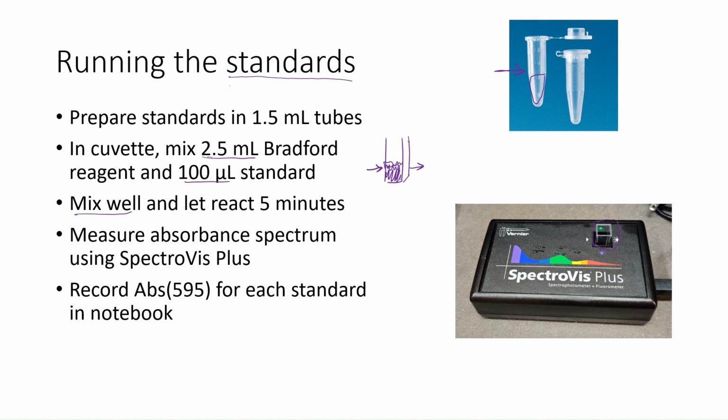You can use a micropipette, and you'll want to use a fairly large tip size and volume, probably closer to 1 milliliter, to mix thoroughly and efficiently. If you don't want to pipette the sample up and down, you can also just stir in the cuvette with the pipette tip, and that should be sufficient to mix it pretty thoroughly.